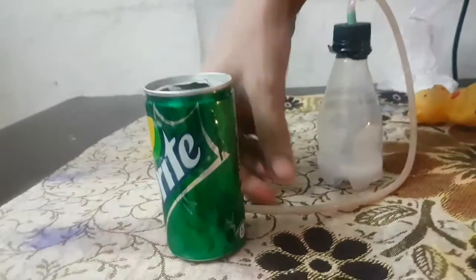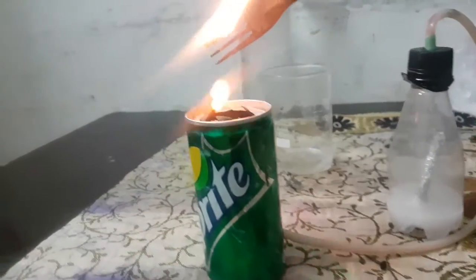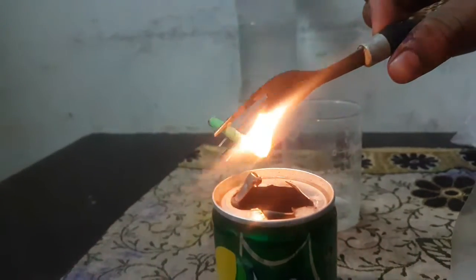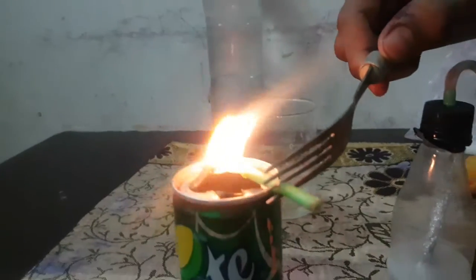The hydrogen is coming out of the pipe. We are going to lift it. Which gas is this? This gas is hydrogen.